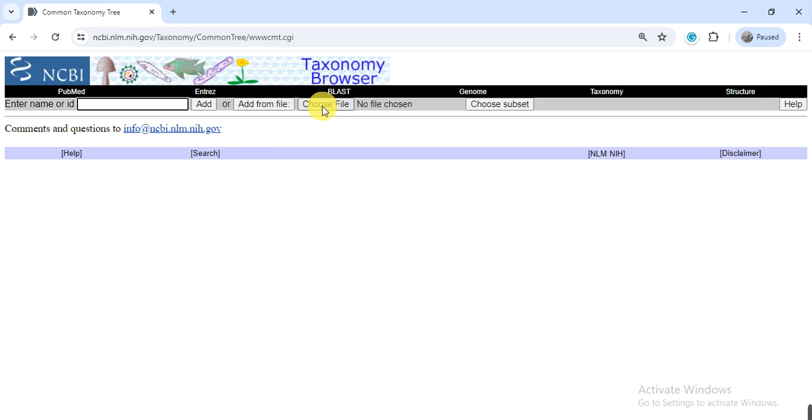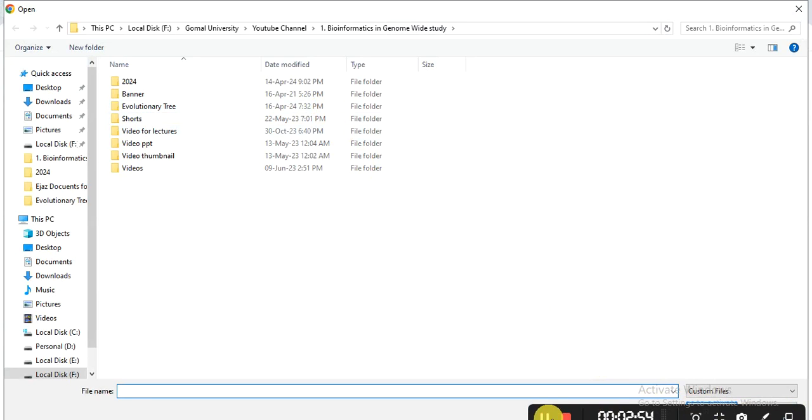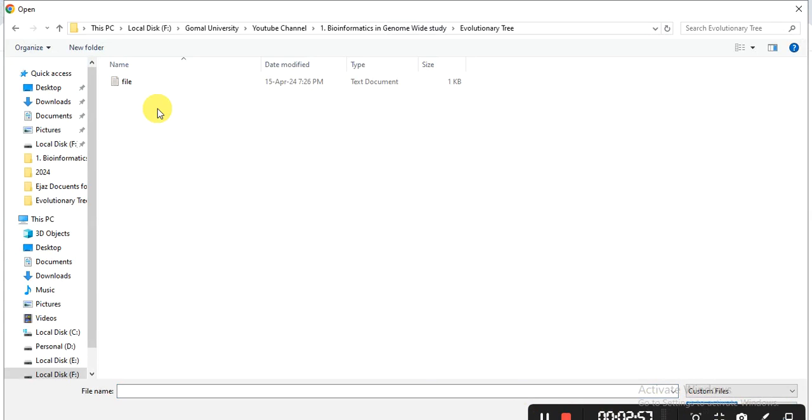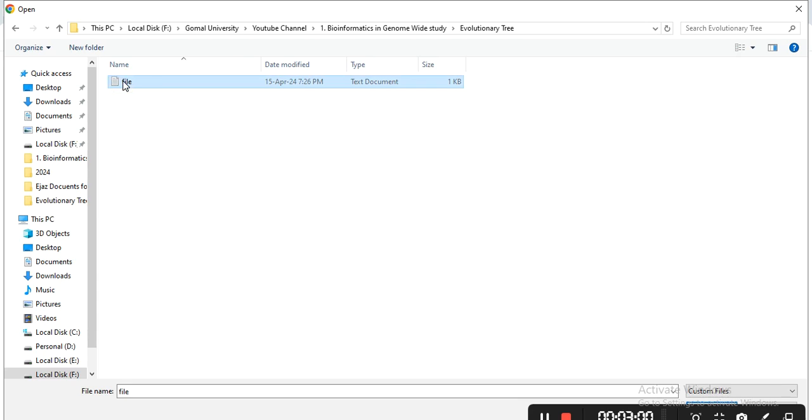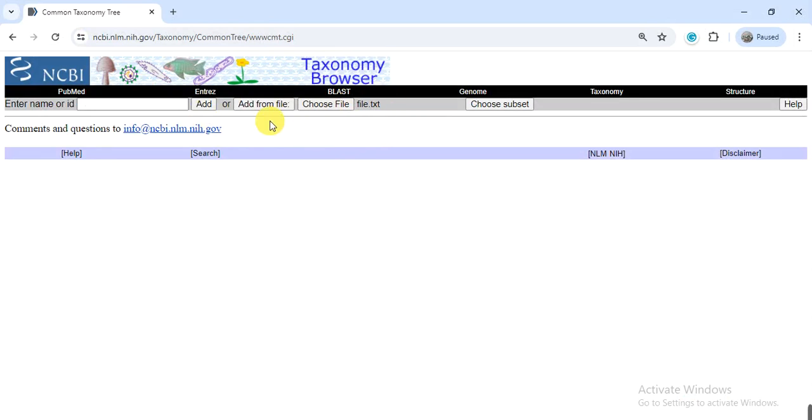Then go to the choose file and then find your file, that is evolutionary, this one. So here, my file is attached. Now click on add from file.